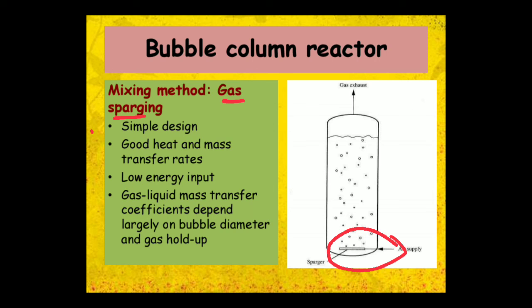It is a simple design, good heat and mass transfer rate takes place. It requires low energy input and gas liquid mass transfer coefficients depend largely on the bubble diameter and gas holdup. This is the exhaust point for the gas.